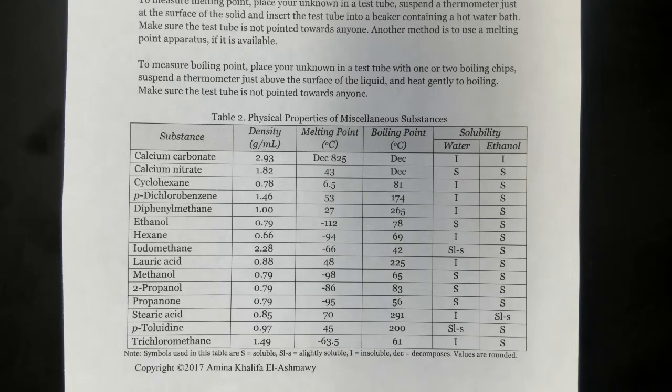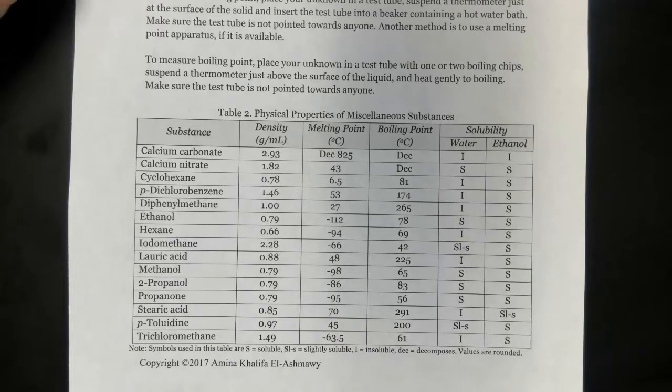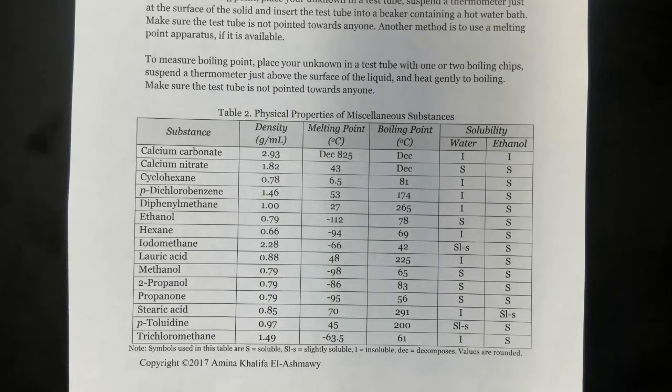Okay, this is the Prelab video of the experiment identifying an unknown substance. Now this is an experiment. So when you watch the experiment video, you need to take notes as if you were taking a notebook, as if you're really there conducting the experiment.